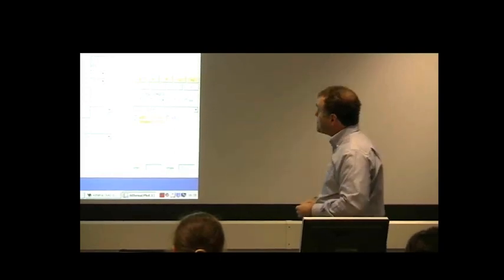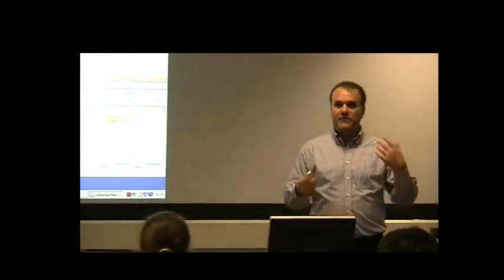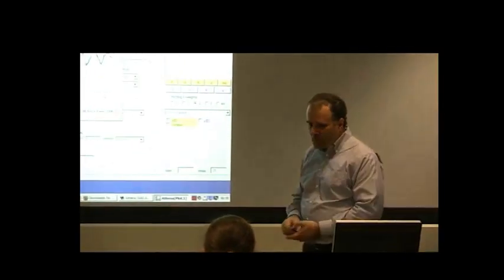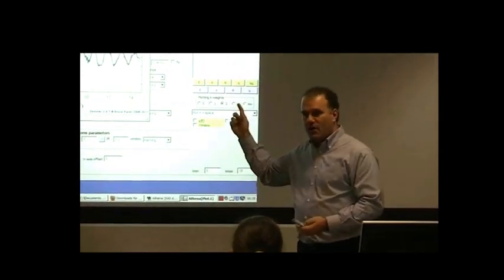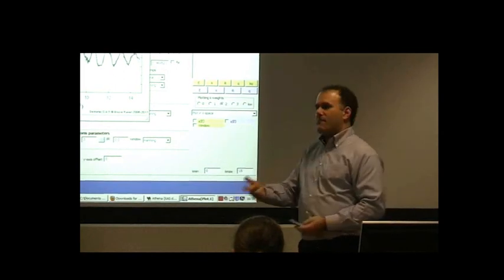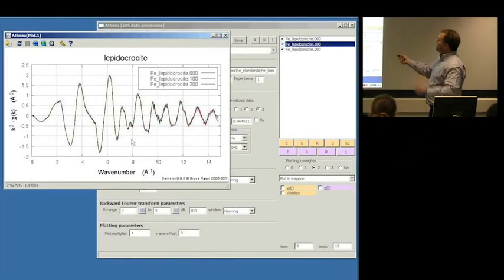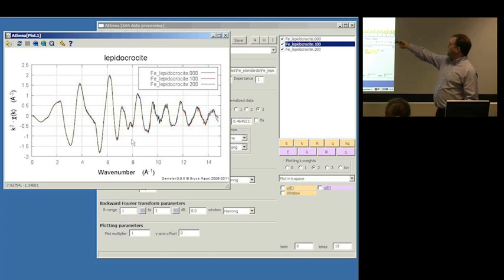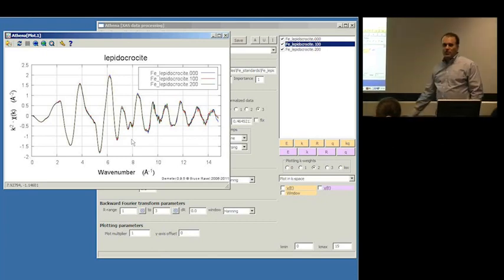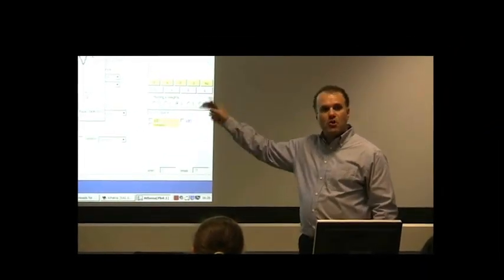Each individual spectrum may not be the thing that you want to go ahead and analyze because each individual spectrum will be noisy. But as I showed you in my talk on those mercury edge data, one scan was awful, but when I added up 42 of them, I had something I could use. So the next step in data processing is to merge the data. If this were my research problem, instead of going off and measuring scan 0, scan 1, and scan 2 individually, I might instead prefer to merge them up into the average and analyze the average.